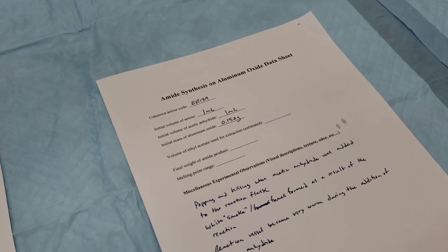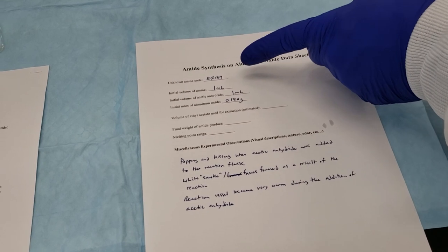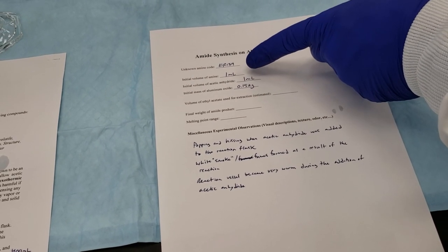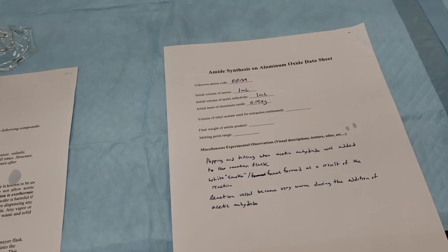So while our reaction is swirling for 10 minutes, let's do a recap on our data sheet. We have our unknown code, ER139. We have our volume of both of our amine and our acetic anhydride, which is 1 mil apiece, 0.152 grams of our aluminum oxide.